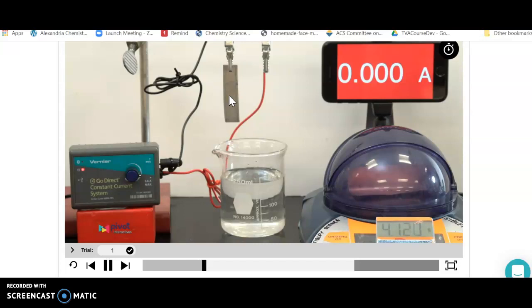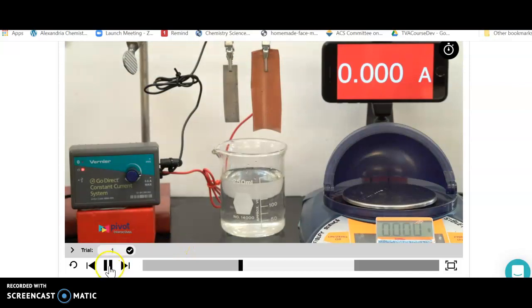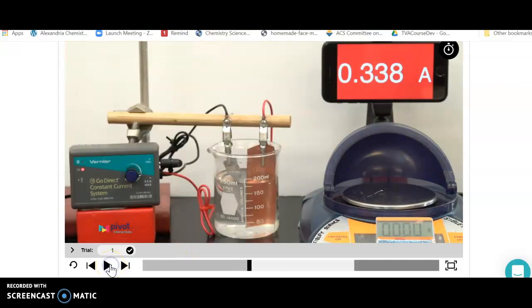To figure out how much copper was used up, we're going to have to start by figuring out how much copper we had. So we're going to weigh the copper, record that value, then take the copper and hook it back up to this cell and set it into the sulfuric acid.